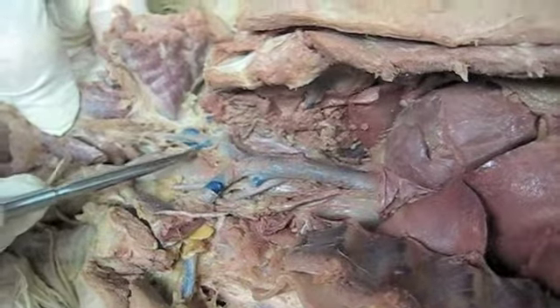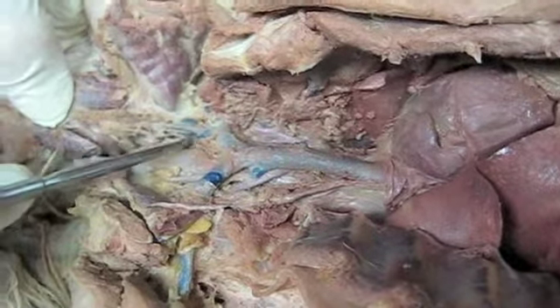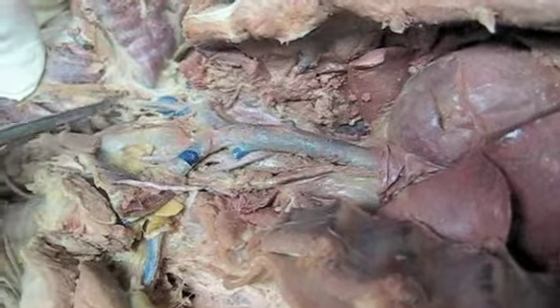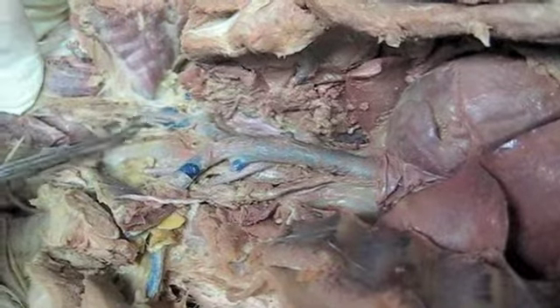And then there's a little internal jugular that comes off, but then it loses its injection. So the bigger one is the external jugular. I wish it was nicely injected, but it's not out here.